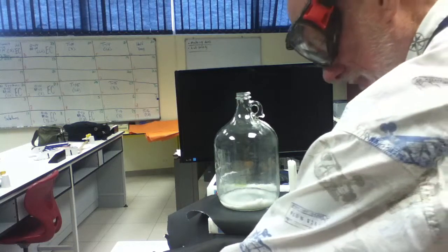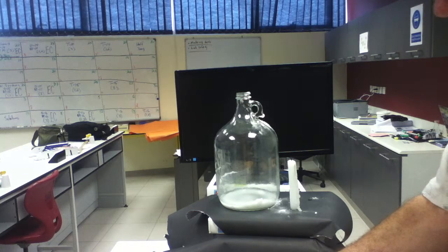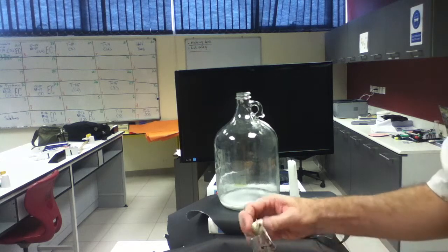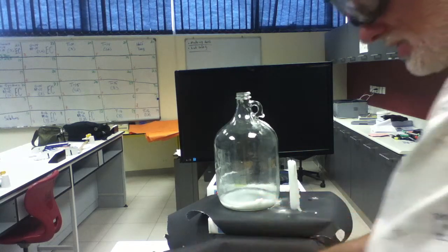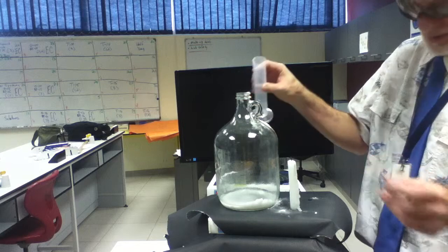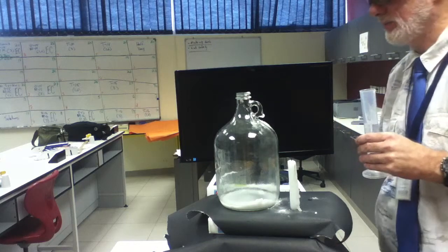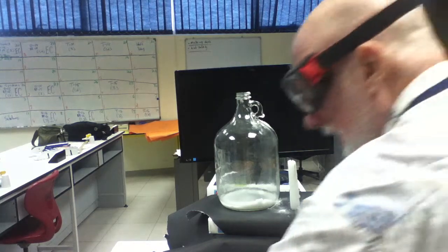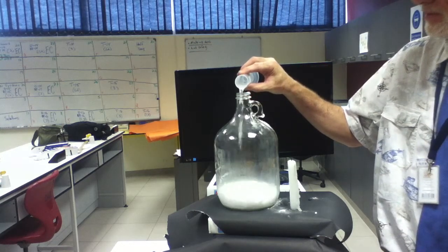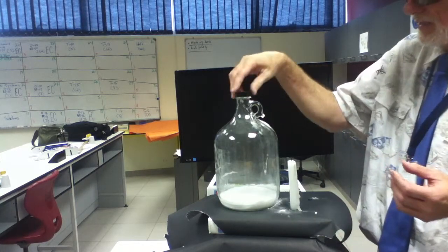Here's some acid. All right. An experiment's great. I love it when they don't work. As long as nobody gets hurt, of course. There's plenty of sodium bicarbonate in here. Let's do this, and let's put something on the top. I have the lid somewhere. Here it is. We'll put the lid on, just to keep the gas in there. Lot, huh? Vigorous or what? You see it? You see it coming out? Hopefully you're able to see that on film.